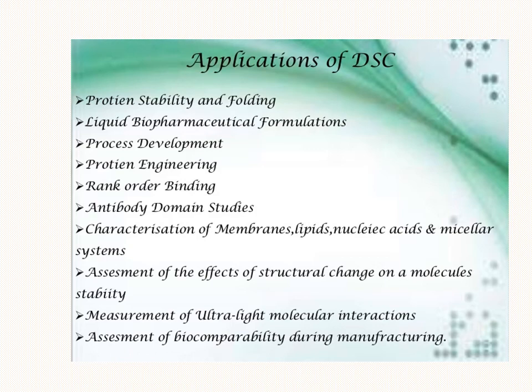So these were the applications of DSC, and it also has some advantages. That is, it is label free, it can eliminate the dye, the results are very reliable, and a small volume is sufficient. It is easy to operate, and it is also automated for high throughput.